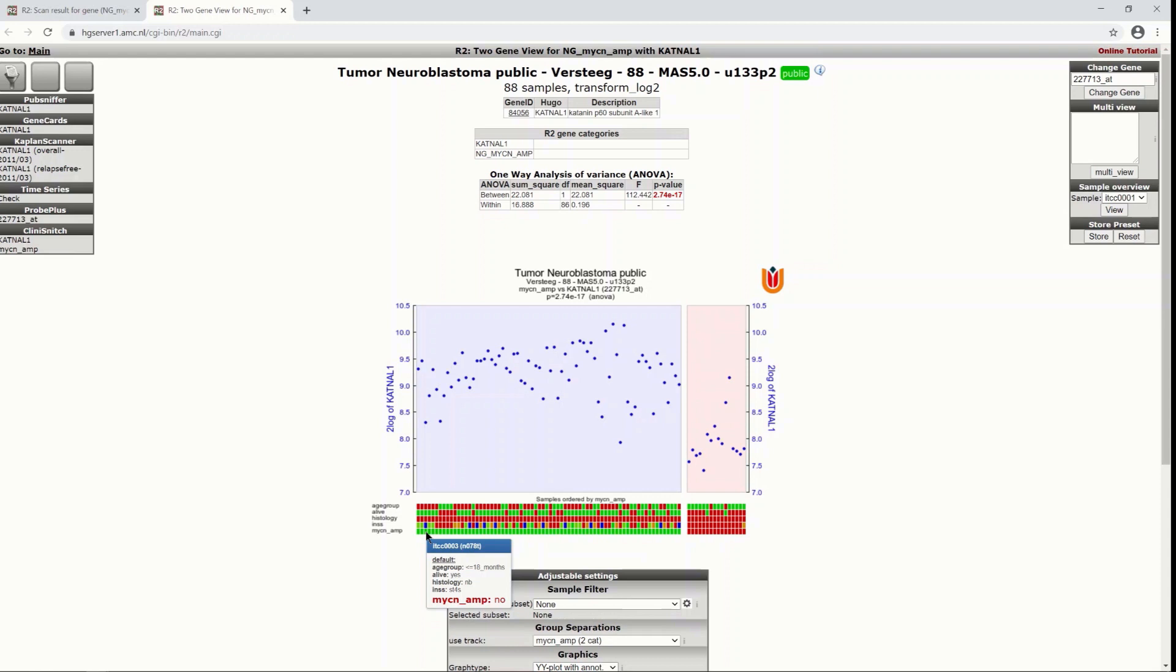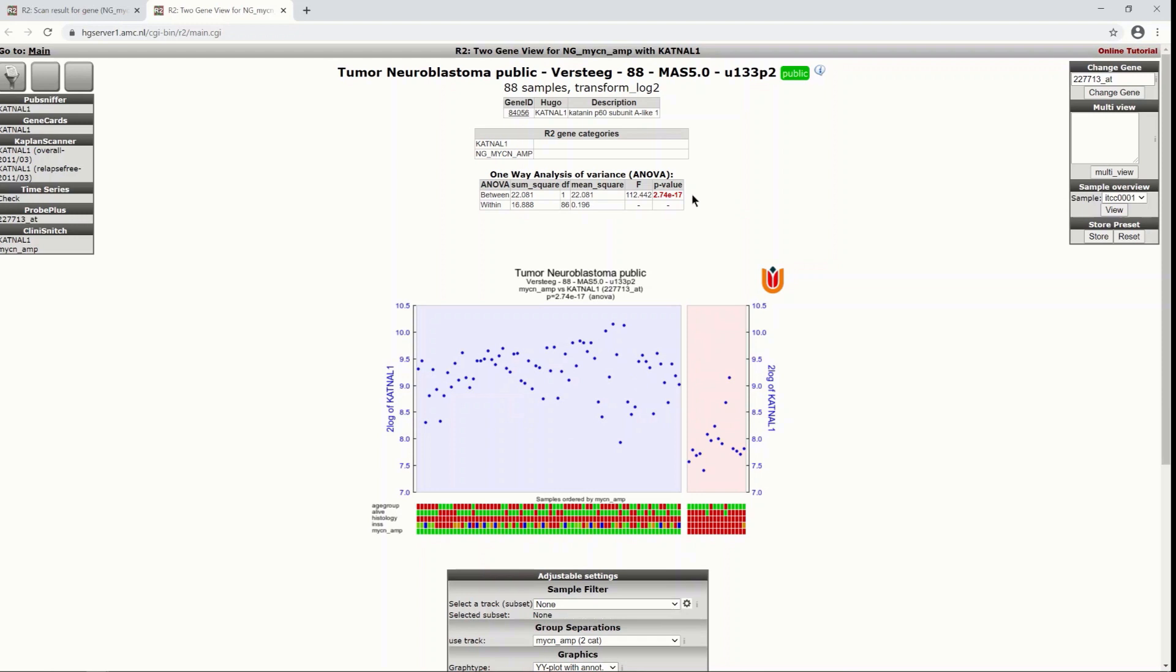And we chose the MYCN amplification and indeed you can see that here we find the no MYCN amplified group and this is the MYCN amplified group. And you can see from the expression values in this group that they tend to be higher. We see here a p-value that is quite low so that gives us confidence that this is a significant result.